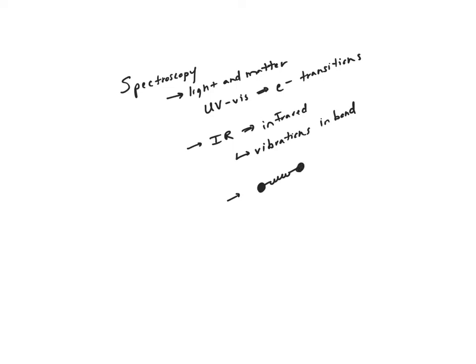Spring, okay? And so we imagine that these bonds and their vibrations were just like two masses connected via a spring, right? And so mass number one would be atom number one, mass number two would be atom number two, and the spring between them was going to be the bond that we were actually looking at with respect to this vibration, okay?